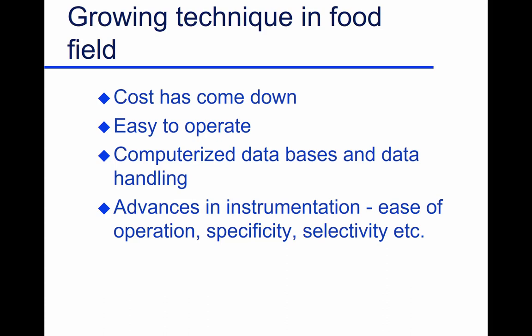Certainly the cost has come down a great deal. We used to look at $1 million for some of our high resolution instruments. Now we're probably in the $250,000, $300,000. They become easy to operate, which is scary, because then you may hire somebody that doesn't have experience in the area, and they may do these library searches. Okay, so there's a downside, but they are basically turnkey systems.